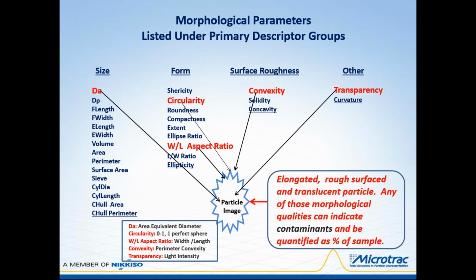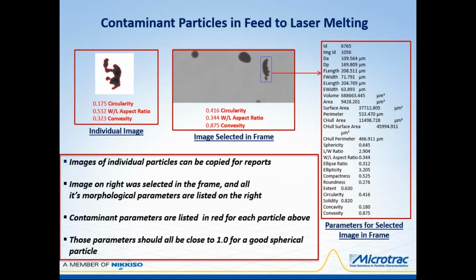The blue outline of a particle image is an example of a particle with parameters which can indicate contaminants in a powder sample or out-of-spec particles in the recycle stream. An elongated, rough-surfaced, or translucent particle image can indicate a contaminant in a metal powder sample. The proportion of the sample identified as contaminants or off-spec particles can then be quantified and reported.